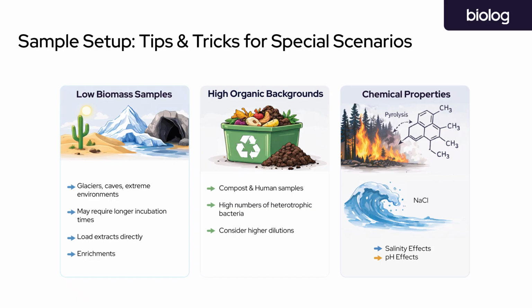Now, there are some special scenarios that might need some adjustments to your workflow, right? So, for example, in low biomass samples, you might need longer incubation times or load your extracts directly onto EcoPlates and avoid the dilution. And then you can measure CFUs or something like that and adjust the density as part of your data analysis later. The opposite is true for high organic backgrounds.